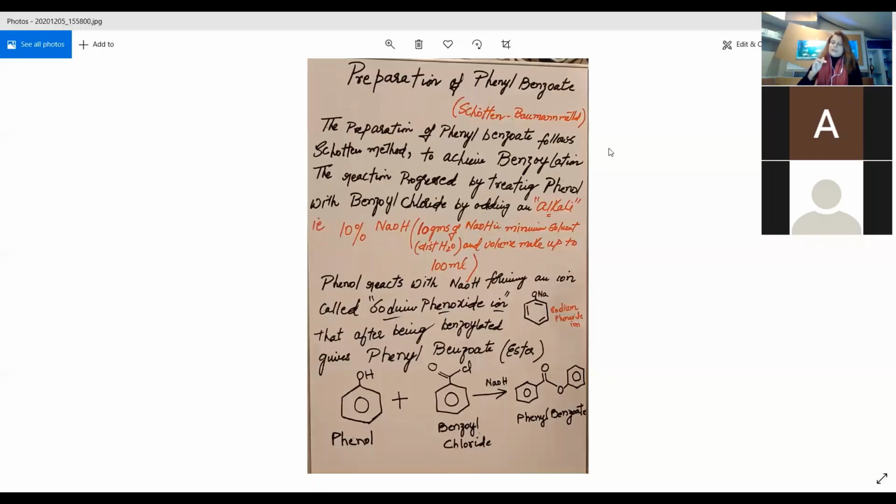And after adding that, you will shake the flask for a little while, and then you make up the volume up to 100 ml. There are marks there, starting from 1 to 100, and up to the 100 mark you fill with the distilled water, and then you shake that solution very nicely, and this is your 10% sodium hydroxide solution, right?